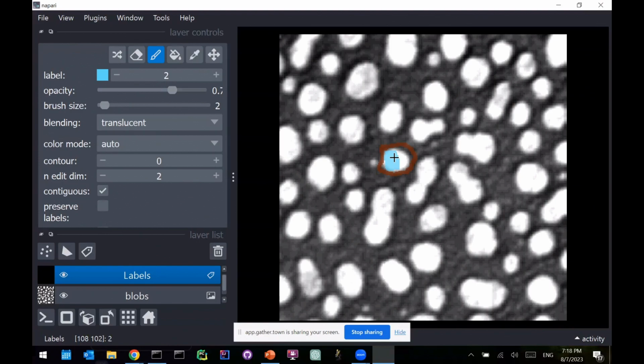If you have never used this tool before, you can also see in the very bottom left of my screen, it says there are labels 110, 101, and then :2. This 2 is the intensity where my mouse is currently located. So I see here I'm hovering over this blue thing. This has intensity 2. It's the label 2 I'm annotating. And here, if I hover with my mouse over here, it's label 1. And when I'm outside, it has label or intensity 0. So nothing is annotated here. That's why it's 0. This is label 1.